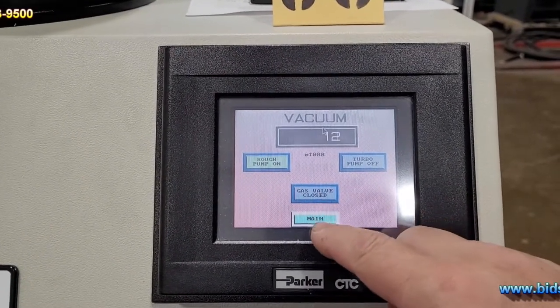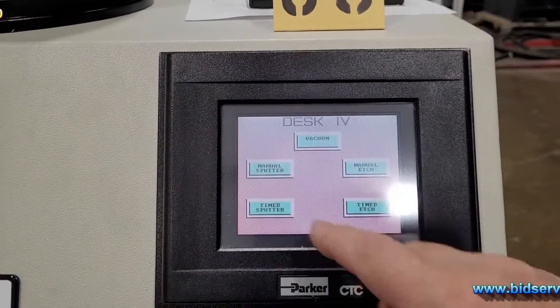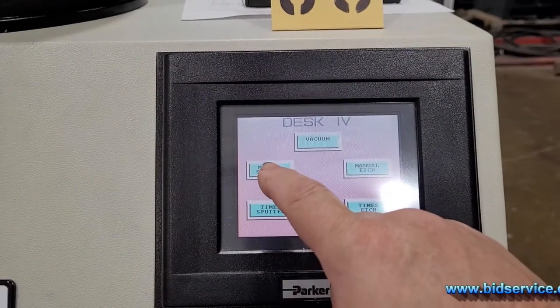You can go ahead and turn on the gas valve if you want, but I'm going to go over to a different manual. I'm just going to put it in manual sputter.